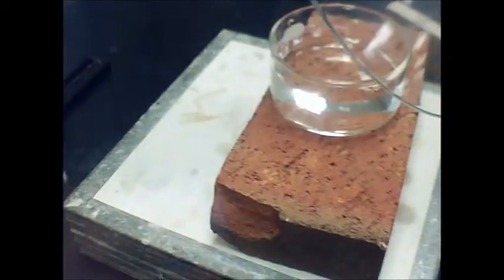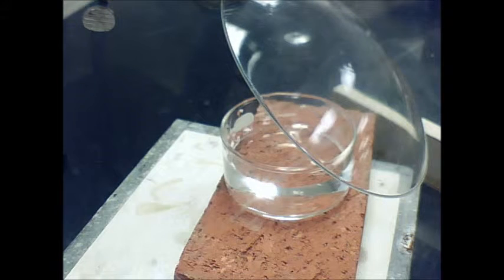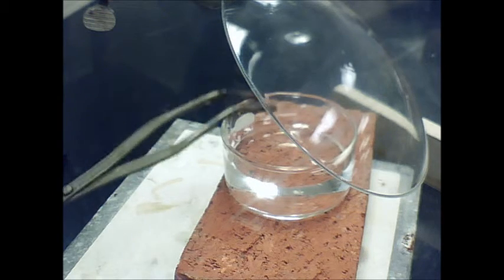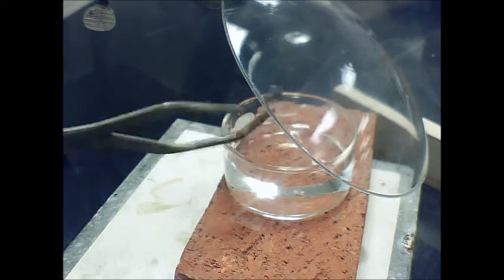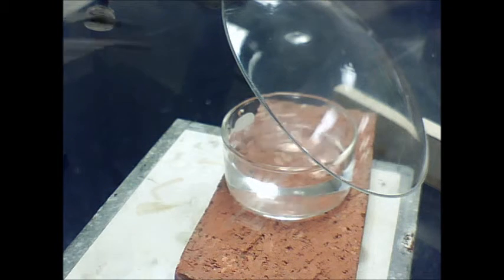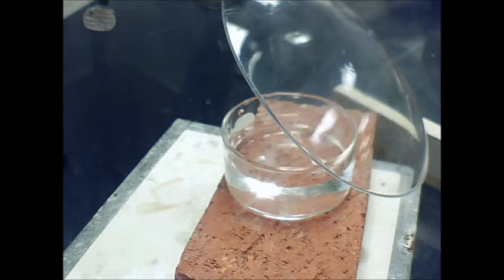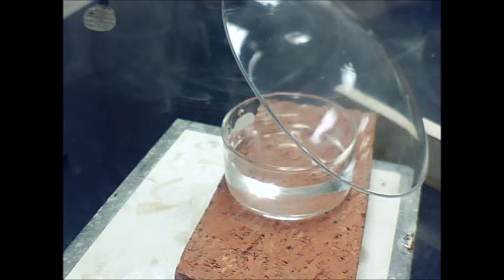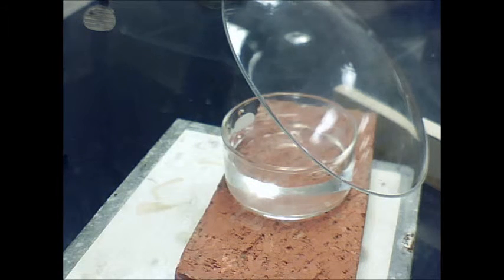All right, so if we take this sodium and we simply react it with water, we're just going to put it in water. I can't get it to let go. So it's stuck kind of to the tweezers. There we go. Reacts quite violently. And that's just a tiny little piece of it. That's sodium, just sodium metal.